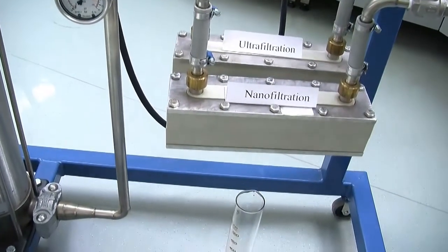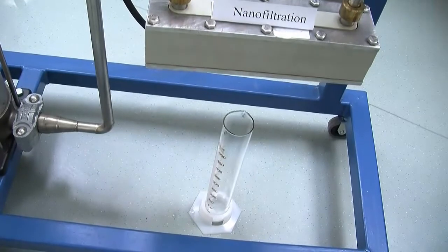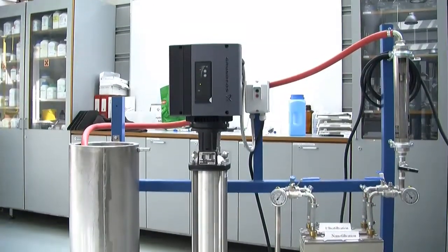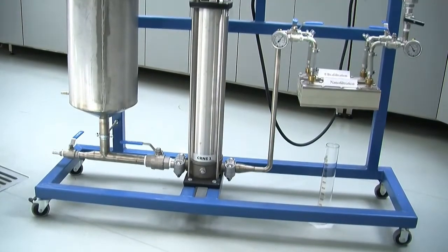The permeate is collected in measuring cylinders. As the membrane used in ultrafiltration is leakier, the permeate flow and, consequently, the flux is greater. However, nanofiltration removes a wider range of impurities.